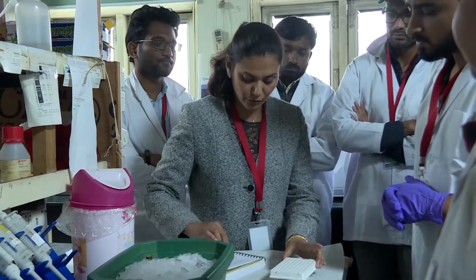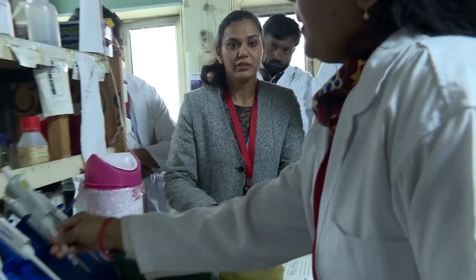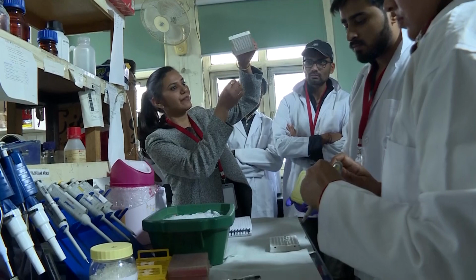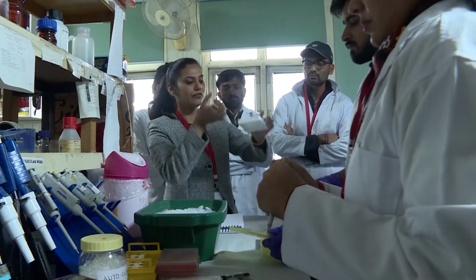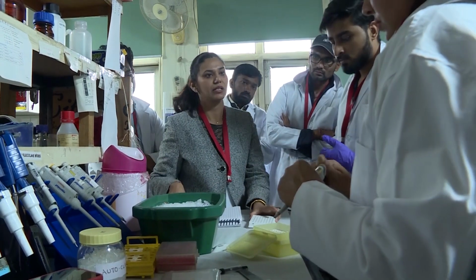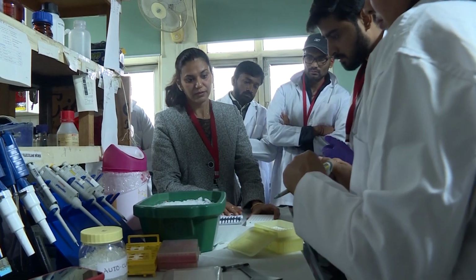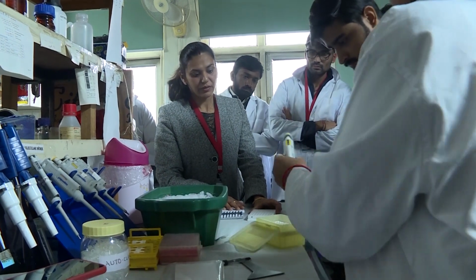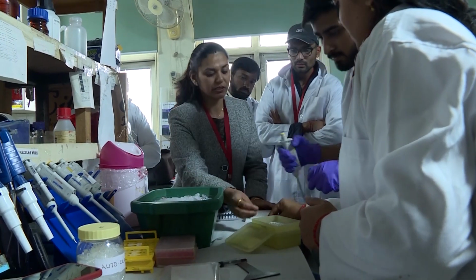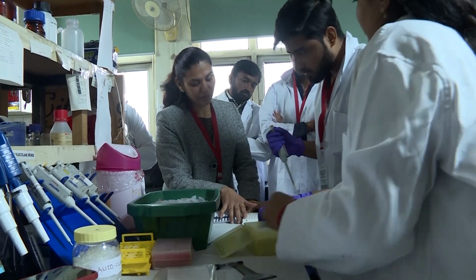Now we have to distribute our sample in the same way. So 20 microliter in each well. You can see there is a well. So we will put 20 microliter according to our plan. First is control gene, control MAP. This is control gene, 20 microliter in A1, B1.